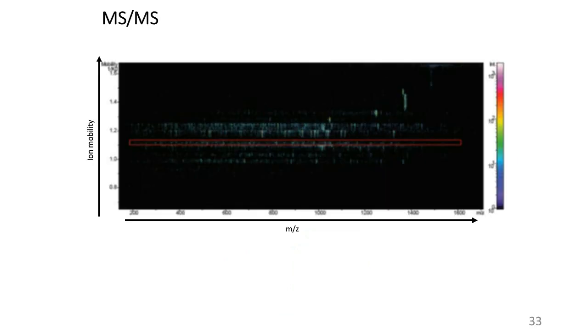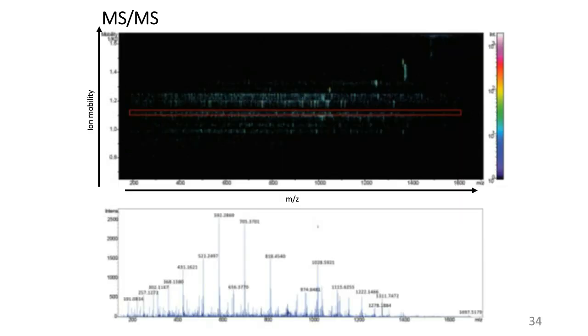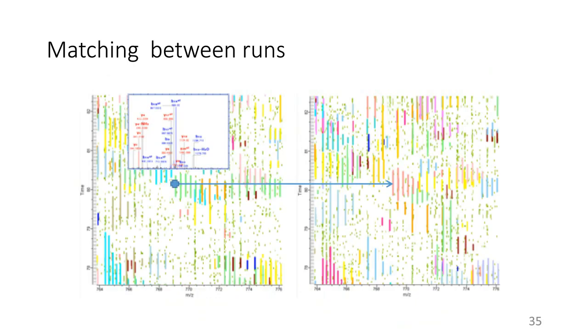We also have to deal with the MSMS spectra, so they are just going to be projected onto a normal MSMS spectrum as we know it, because for each of these MS1 features that we have, we know where to look for the PASEF data that corresponds exactly to this MS1 feature. It just needs to be projected down again to this one-dimensional or two-dimensional data, and the spectra that we get out of this will look like MSMS spectra as you know them from normal LC-MSMS data. And then we have all the parts together that we need for the further analysis of the data.